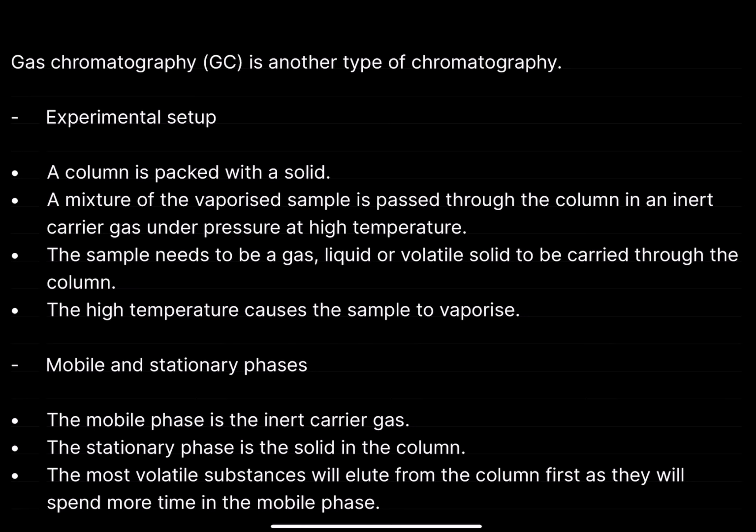And also have a good understanding that gas chromatography, as it says in the title, is good at separating out gases from a compound. We vaporize a liquid of some sort or solid, and we can separate the gases and use the retention time of when they were separated to determine the compound. But sometimes that's not the best way of identifying a compound by retention time, because it can be quite short and narrow.